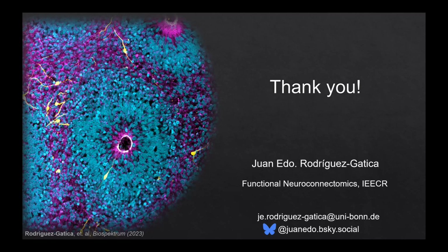And then to avoid the movement of your sample while imaging, you have to reduce the acquisition speed. Usually, if your light sheet is too fast, then you will generate that movement, especially if you are acquiring mosaic view. But besides that, at least for us, there is no other.